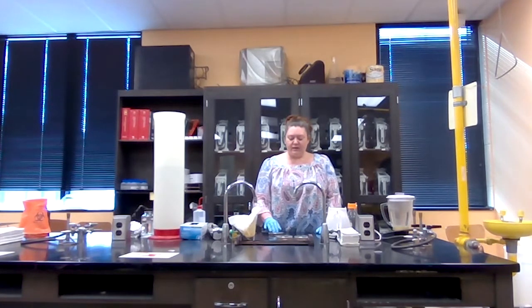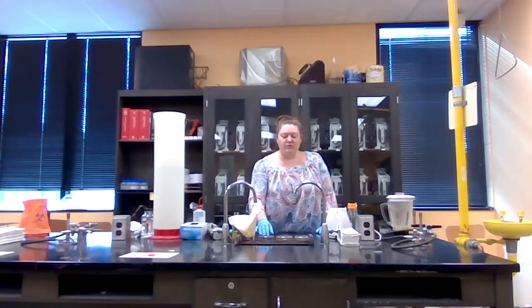So with our samples here, what we would do now is place them into an incubator. We keep the incubator at body temperature, because at body temperature, organisms that are likely to make us sick grow really well. They're very, very happy at body temperature. So I would take these plates and put them into an incubator at body temperature, and then we leave them there for 1 to 2 days.